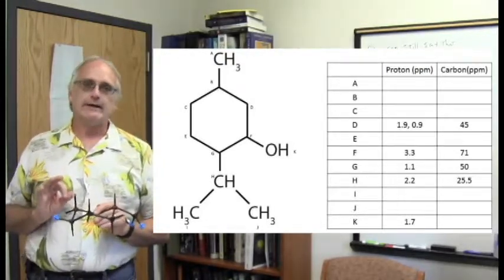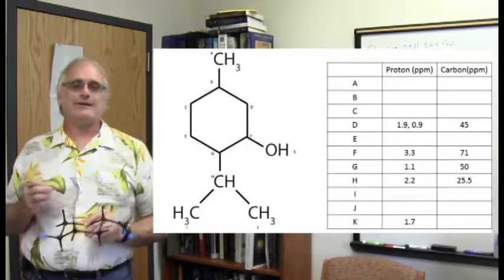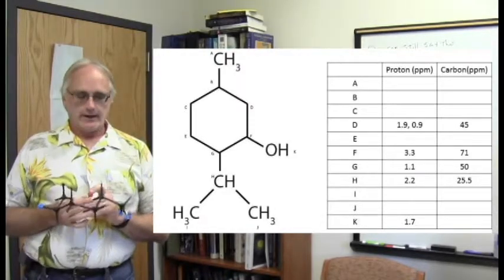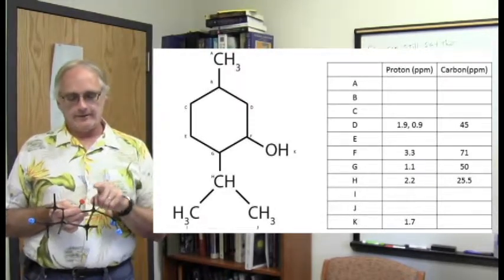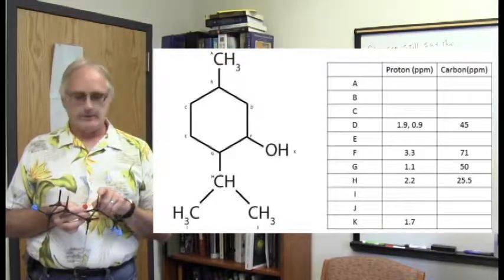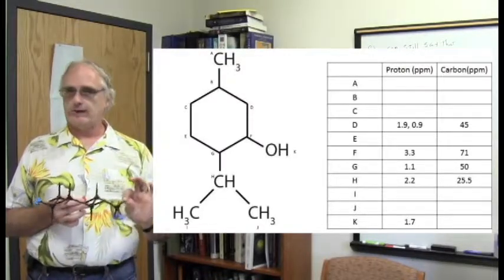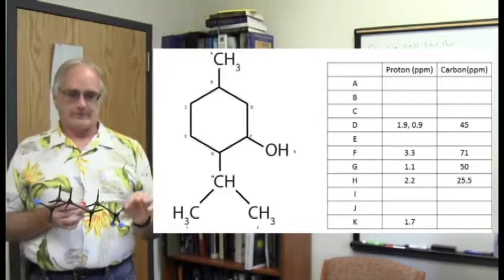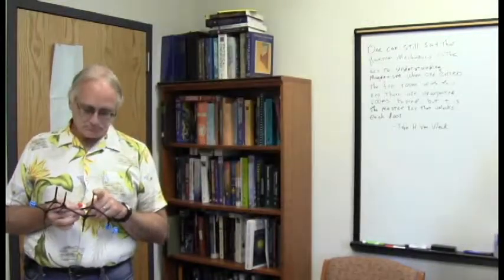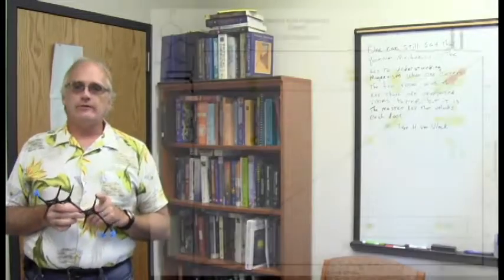on solid ground. And it's interesting when I do that, because doing this illustrates an issue that COSY spectra can have sometimes. What I want to do is confirm that if this truly is position G, then it also ought to show in the COSY a crosspeak, a coupling, to position H. Now this is one of the obvious ones, the septet of doublets. We are looking for the thing causing the doublet over here. And if you look at the COSY, you do see a crosspeak.